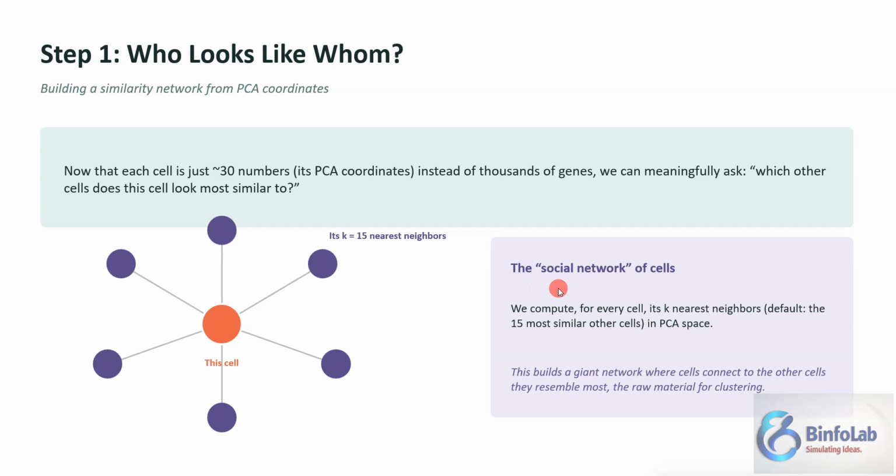Just like calculating a social network, now we are going to calculate the social network of cells. That means which cell looks most like another cell, or which cell is most similar to which cell. We will call it the social network.